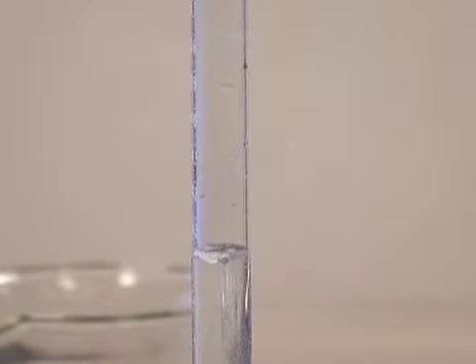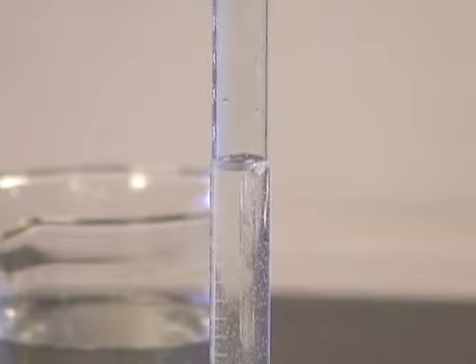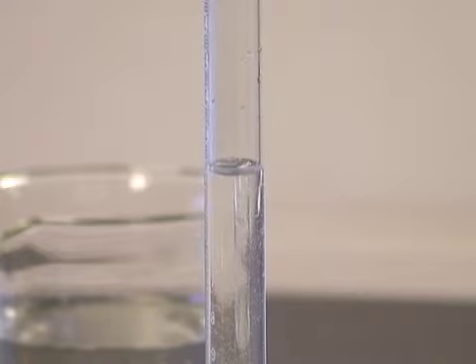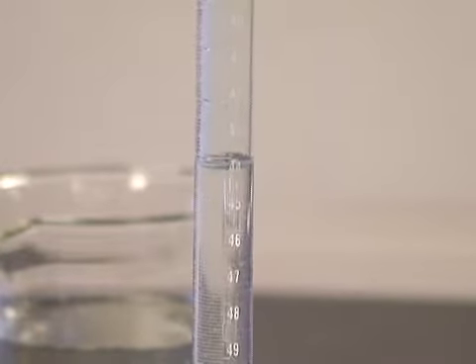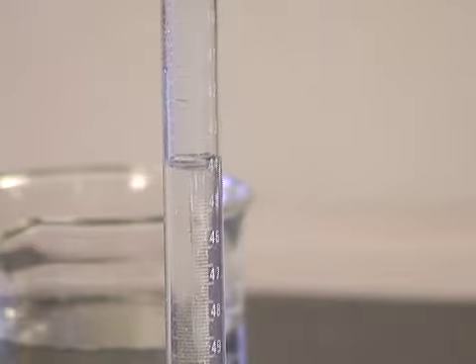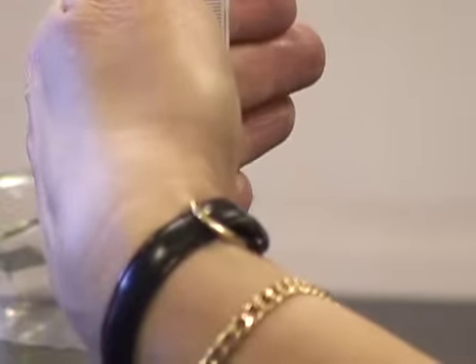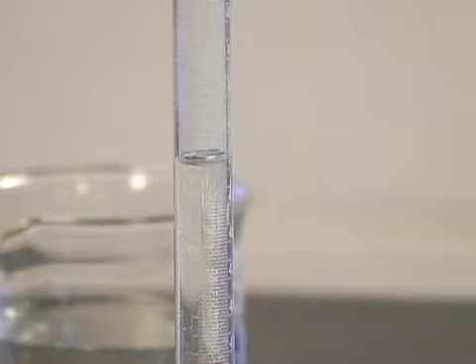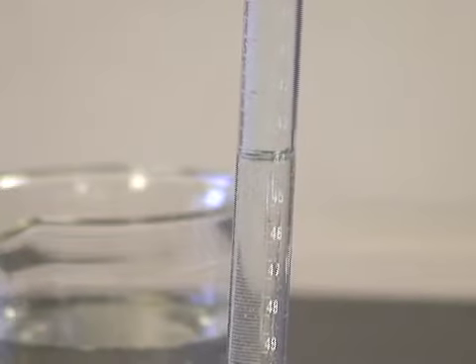And I see I just have a little tiny piece bubbling away. One little piece broke off. Almost. And there we go. No more magnesium to be seen. And I need to get my final volume. And my final volume is 45.2 milliliters. And as long as we're consistent with the way that we're reading this, that's what is most important. Reading it consistently.